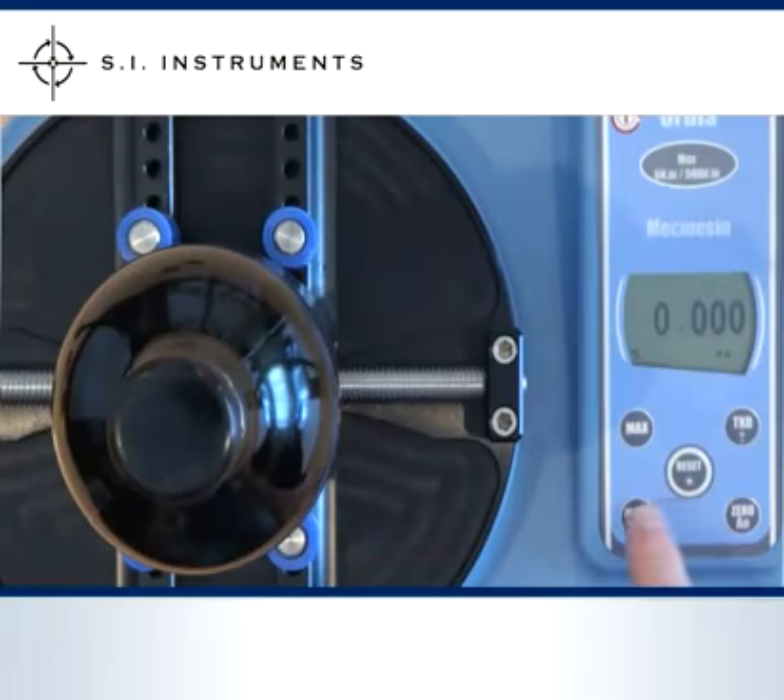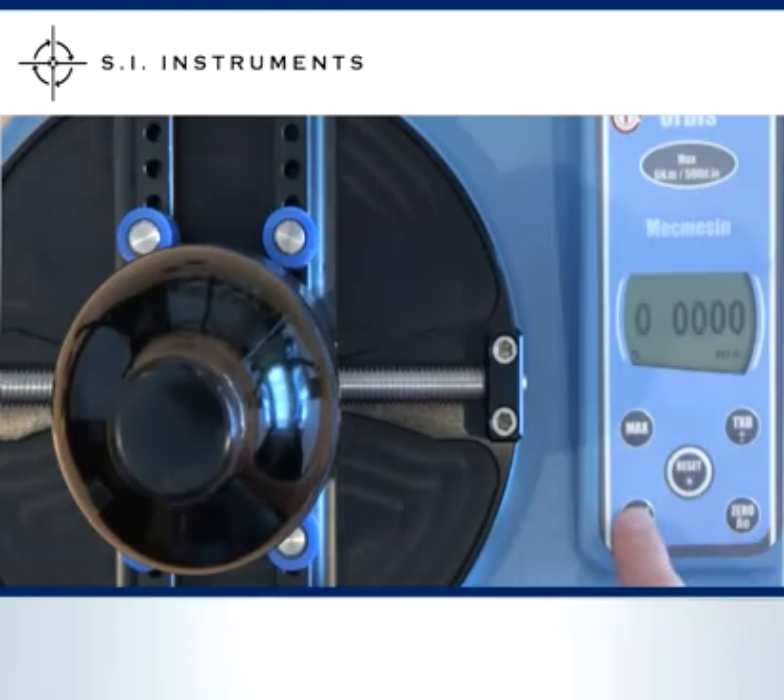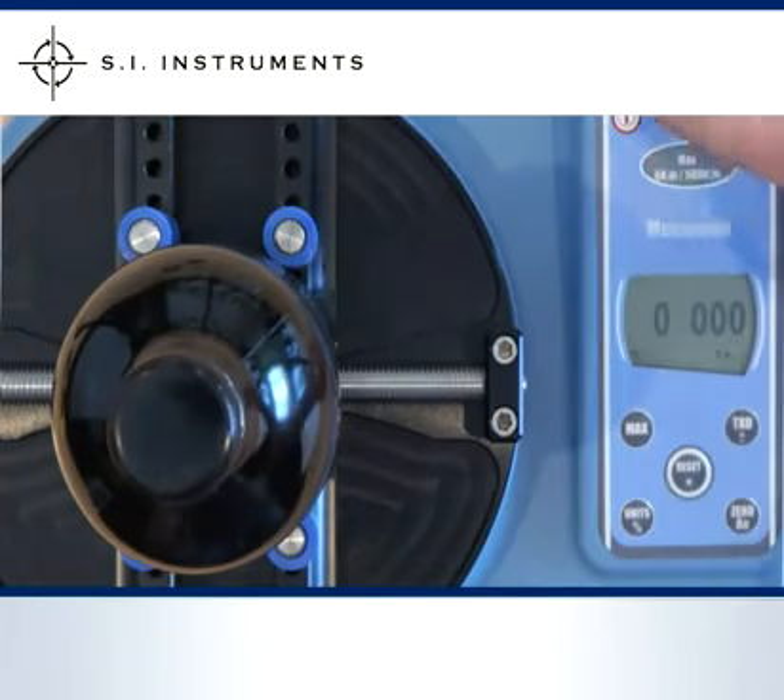There are ten different units of measurement including newton metre, inch pound and kilogram centimetre. The readings can be converted to different units of measurement. When the unit is turned off and switched back on the same unit of measurement will be automatically selected.